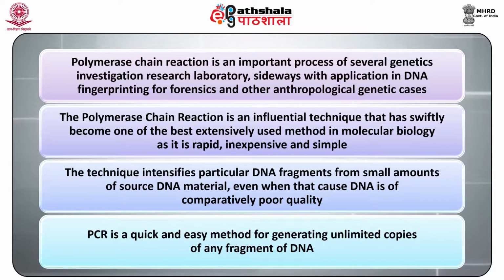The polymerase chain reaction is a powerful technique that has swiftly become one of the most extensively used methods in molecular biology, as it is rapid, inexpensive and simple. The technique amplifies a particular DNA fragment from a small amount of source DNA material, even when that source DNA is of comparatively poor quality. PCR is a quick and easy method for generating unlimited copies of any fragment of DNA.